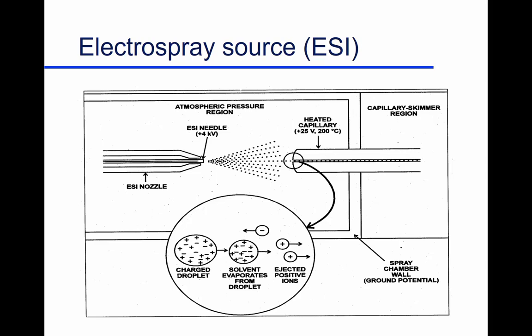This is electrospray, what's actually happening. So here's our liquid chromatograph over here. Our liquid chromatographic column goes through its whatever, and we get our effluent coming out here, well, actually in the center. So this is the effluent from the liquid chromatograph. We typically have high purity nitrogen coming along the side. And we put about 4,000 volts of potential on this middle connection, middle line here. And that tends to spray out. And so what's really happening is, due to that 4,000 volts, this is our droplet. So this is a droplet that came out here, if that makes sense to you.